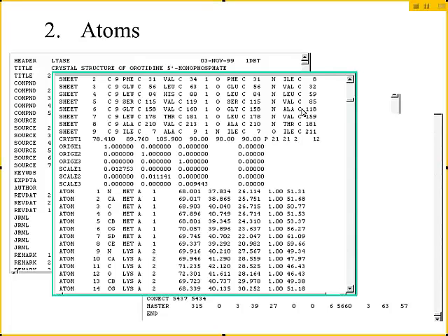And then if you have a longer side chain, you have zeta. Now, if you have two betas or two gamma positions or two deltas, then you'll see a number following one or two. C beta 1, C beta 2, for example. And so all of these atoms belong to a methionine residue, and that residue is residue number one.